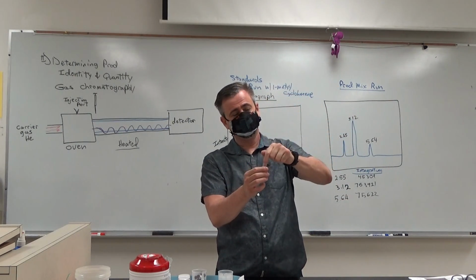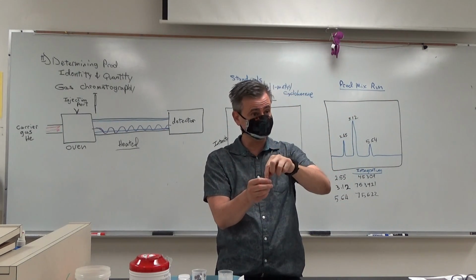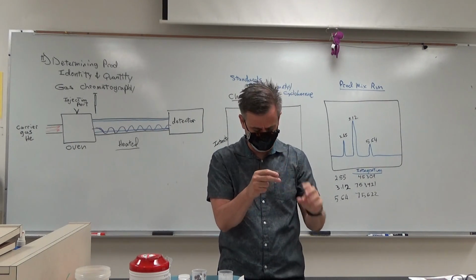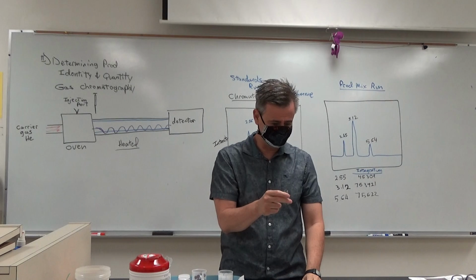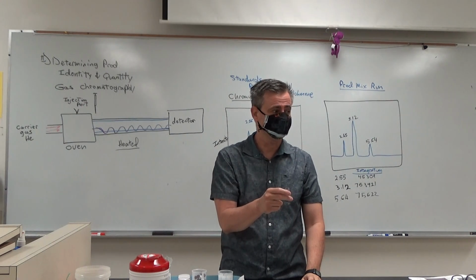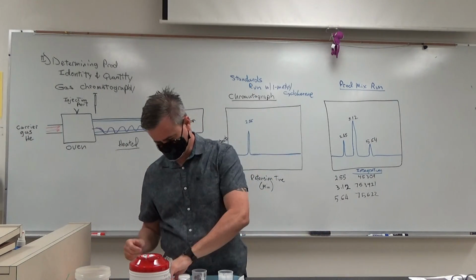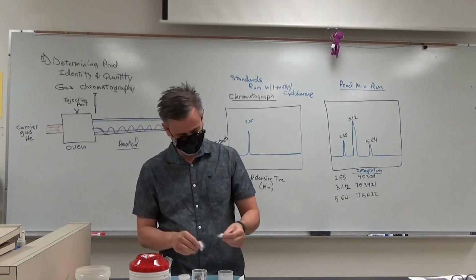Then you're going to add 1.5 mL of chloroform. Sorry, brain freeze.